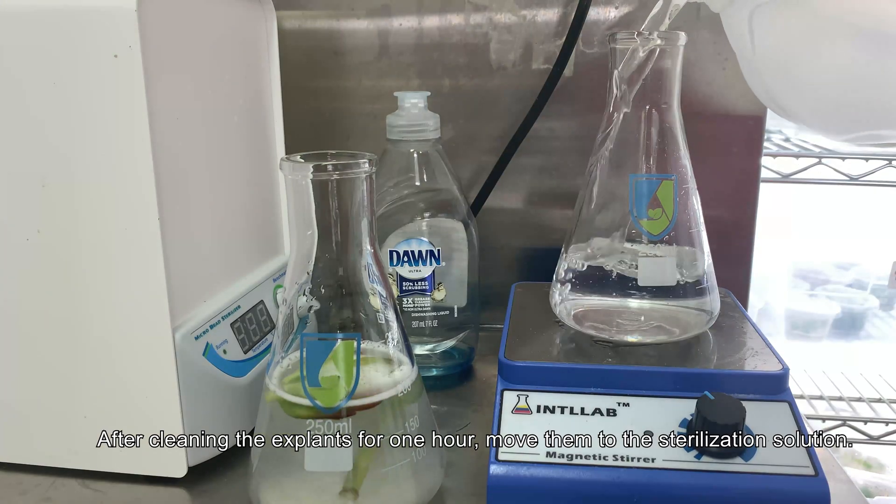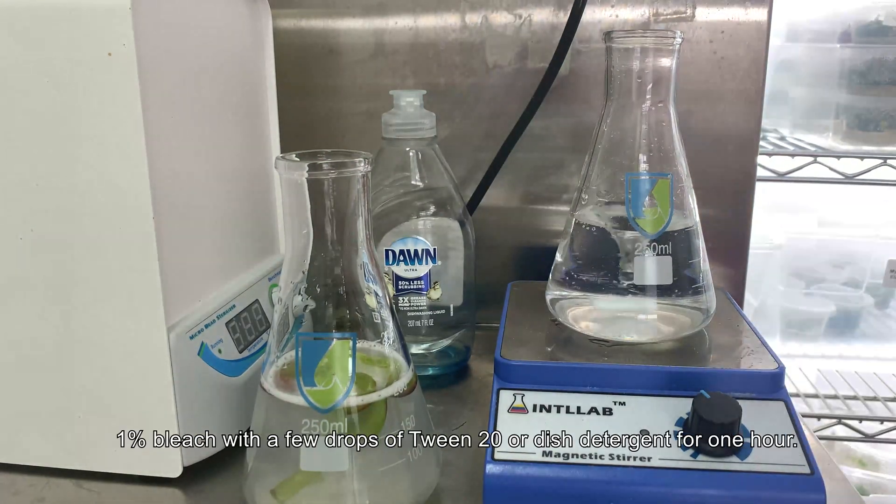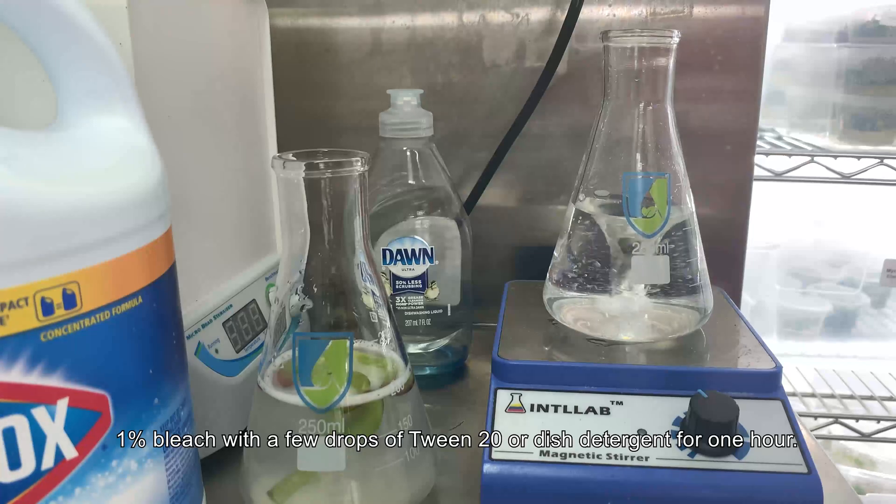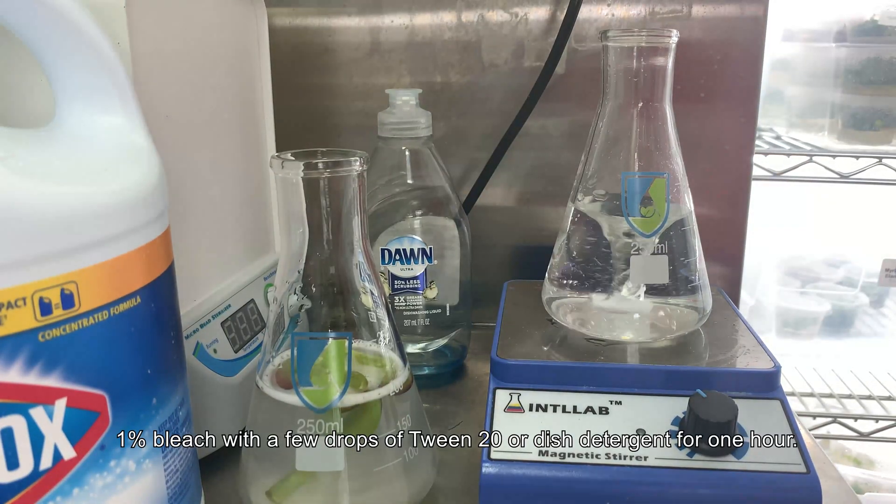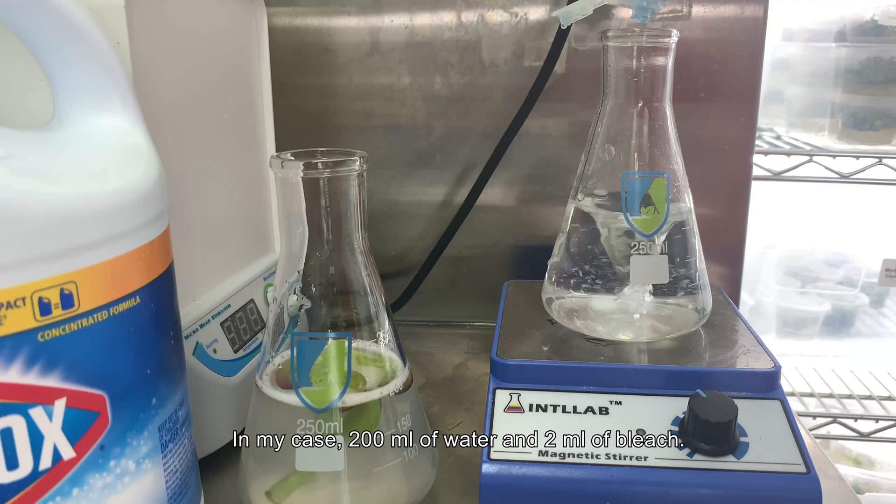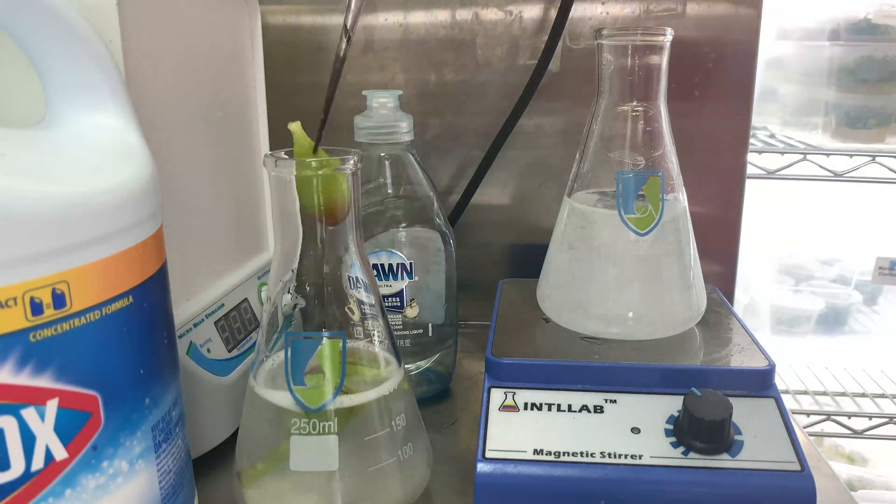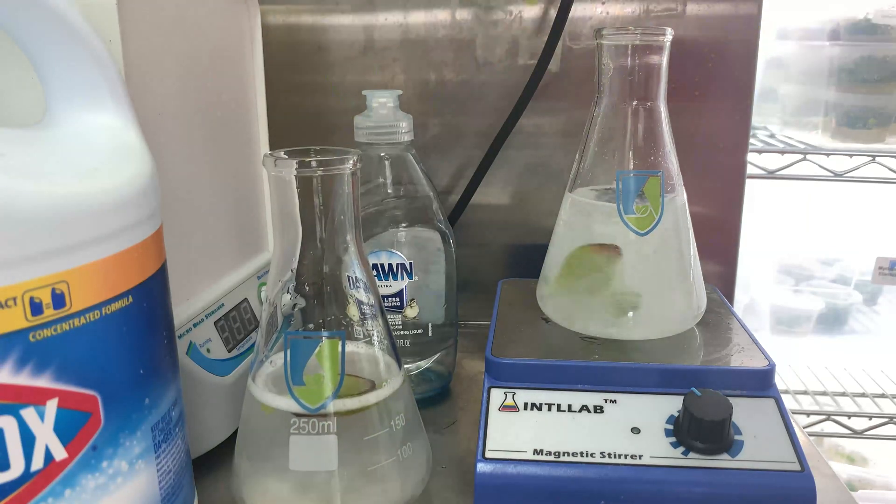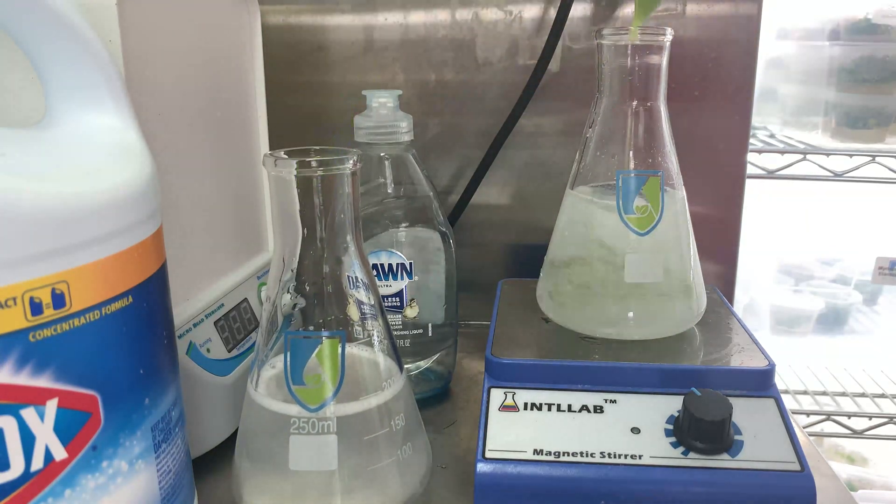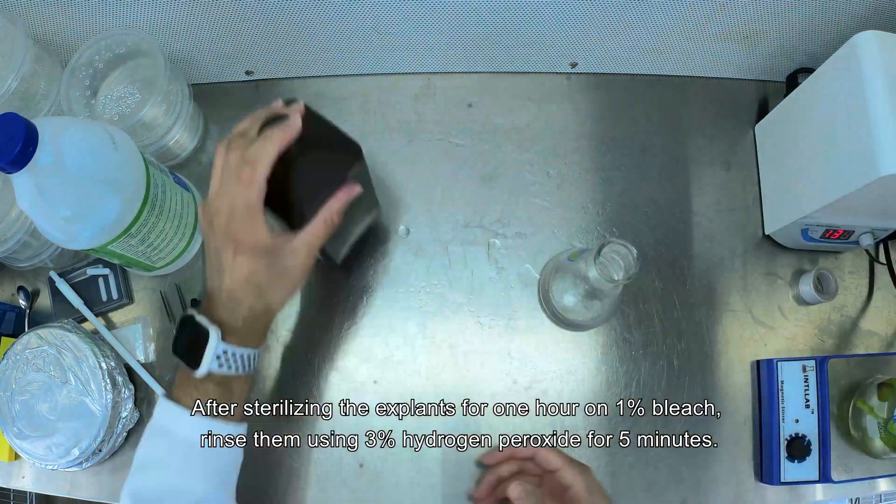After cleaning the explant for one hour, move them to the sterilization solution: 1% bleach with a few drops of Tween 20 or this detergent for one hour. In my case, 200 ml of water and 2 ml of bleach.